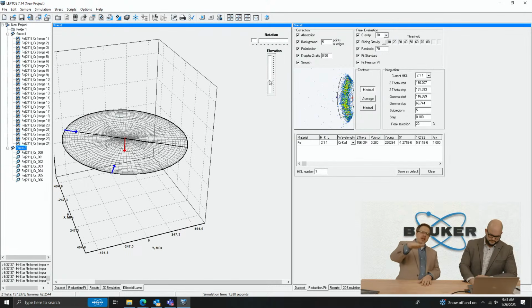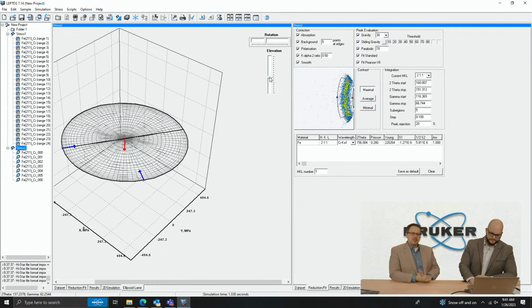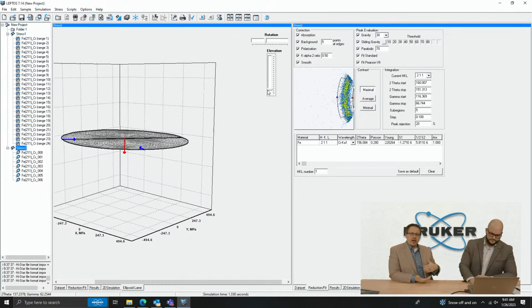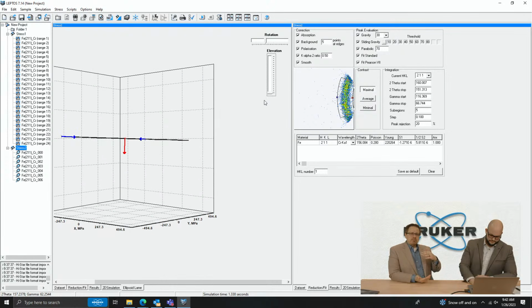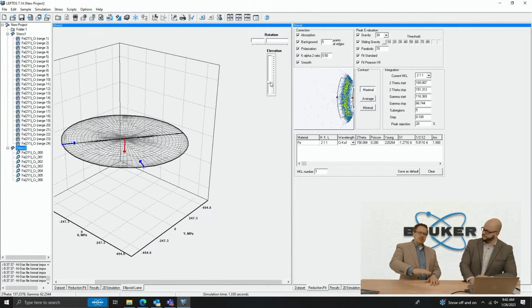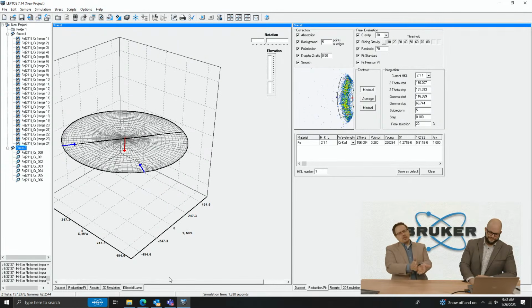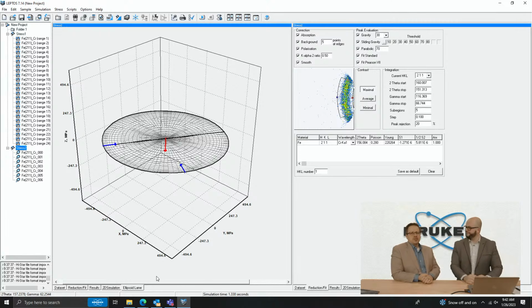But when you tilted it down, we could see it was slightly oriented relative. That can come from two things. One would be that the stress is actually a little out of the plane. The other thing, especially if you have curved surfaces, is that when you mounted it, it wasn't perfectly flat. Like you were hitting off to the side of the curve a little bit.